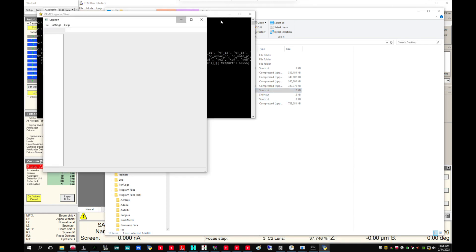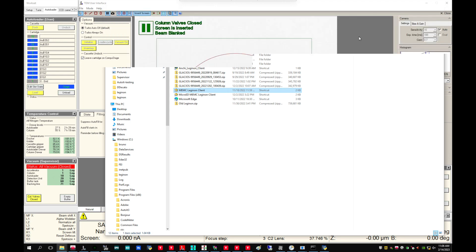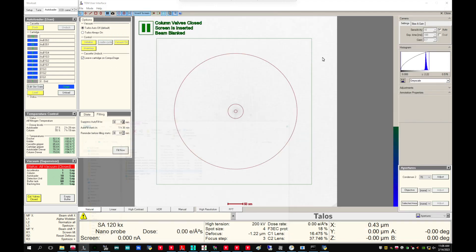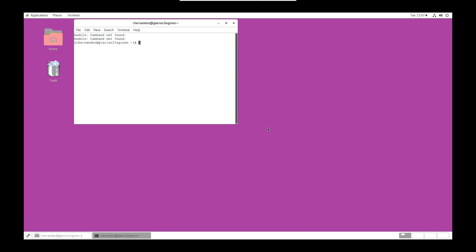You can then minimize the windows. On the Legenon PC, right click and open terminal. Type in NCCAT Legenon or MEMC Legenon based on the center you are utilizing. Hit enter and Legenon will open.